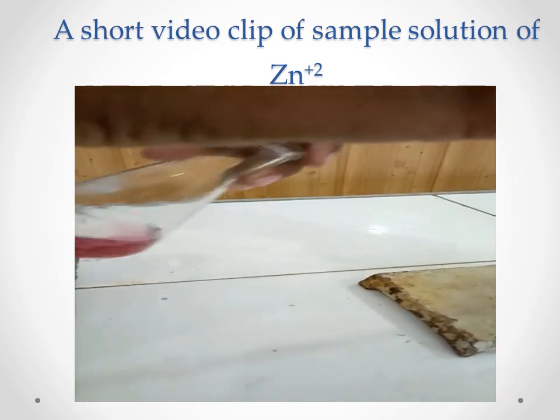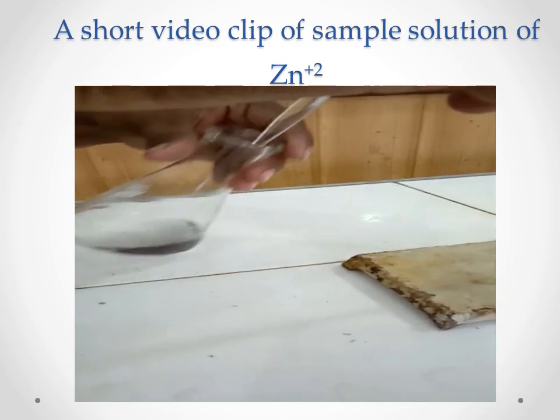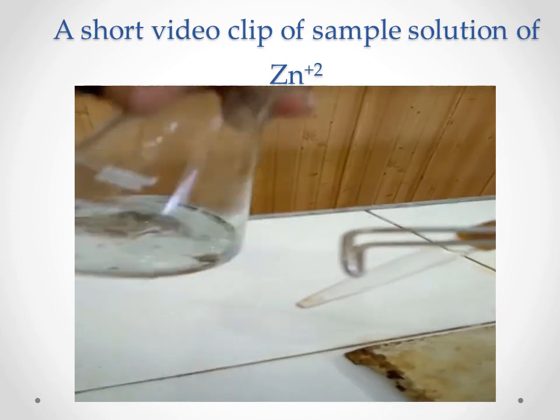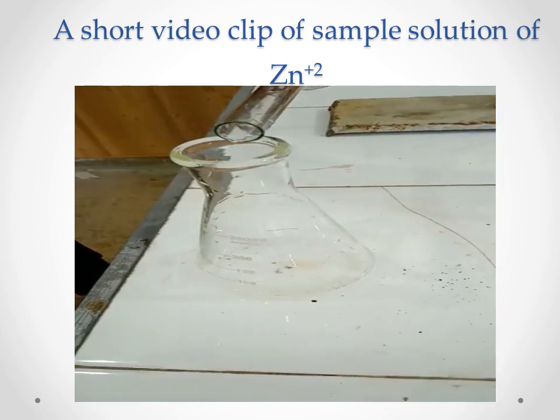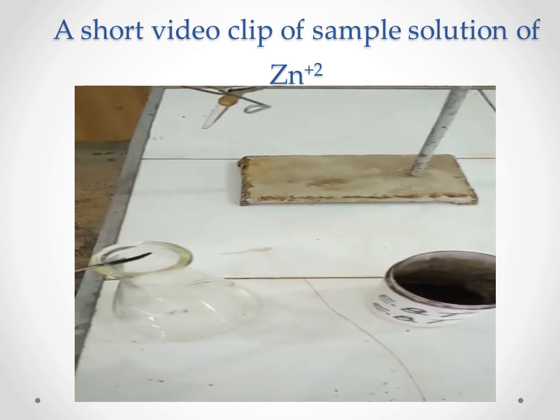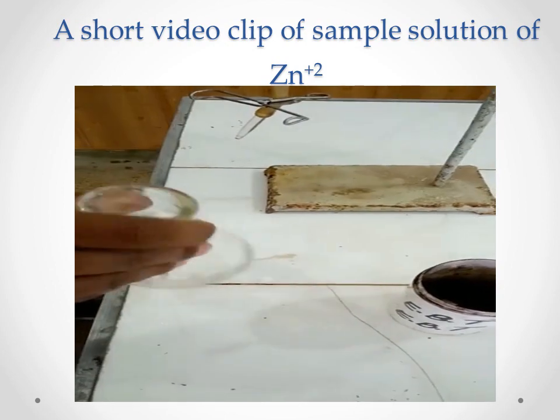You can see the red colored complex is going to break, and from red, purple color appeared, and then at the final stage you saw the blue colored substance that is indicating the formation of free indicator.